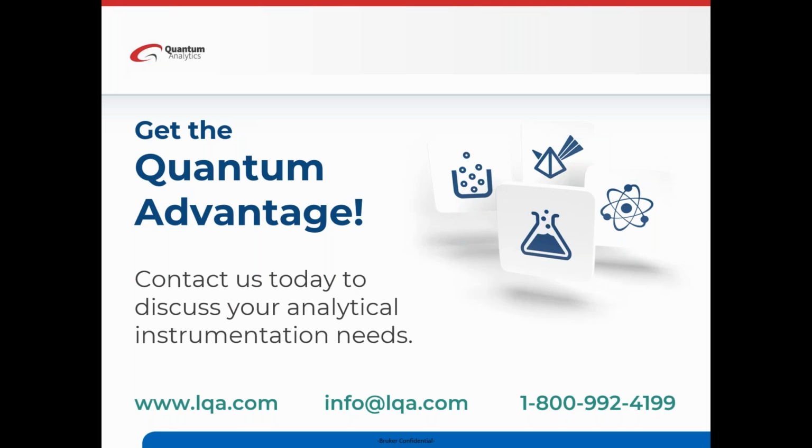Like, I went down to one customer in Florida, and they were like, well, I'm not getting the number one compound for my match. What is it? And I looked under the microscope, and I saw that it was kind of a purple color. I looked up and saw the nitrile gloves there, and I said, well, I don't need to collect the data. It's probably that. And it turned out to be that. Somehow a glove had gotten into their vat for tablets, and there was some of the glove in the pressed tablet that they were looking to figure out.